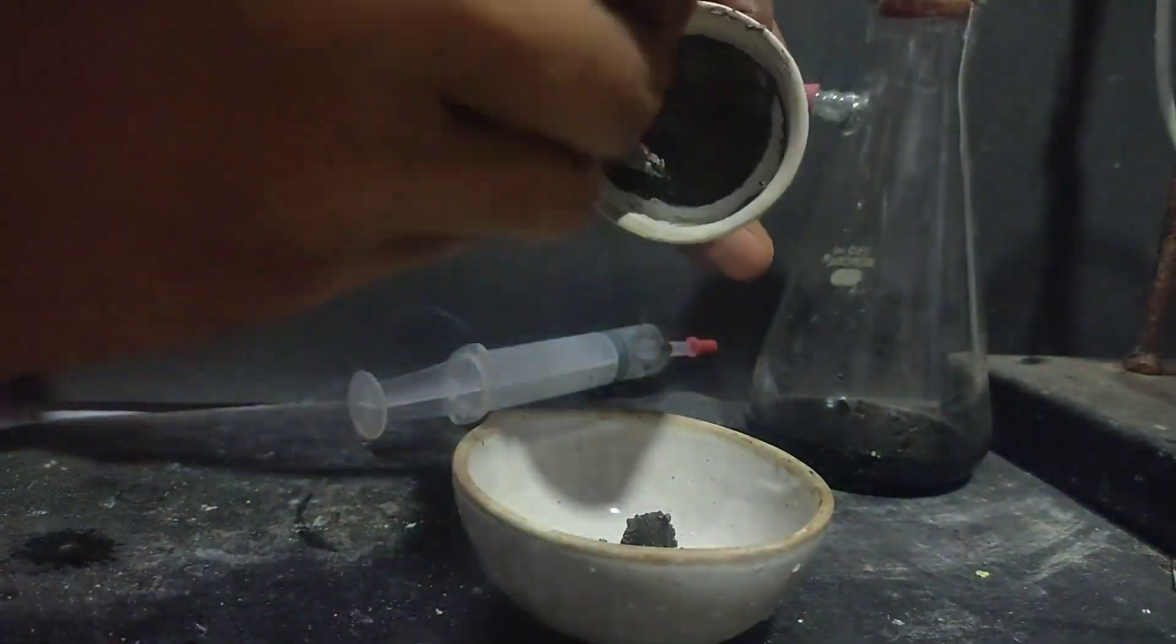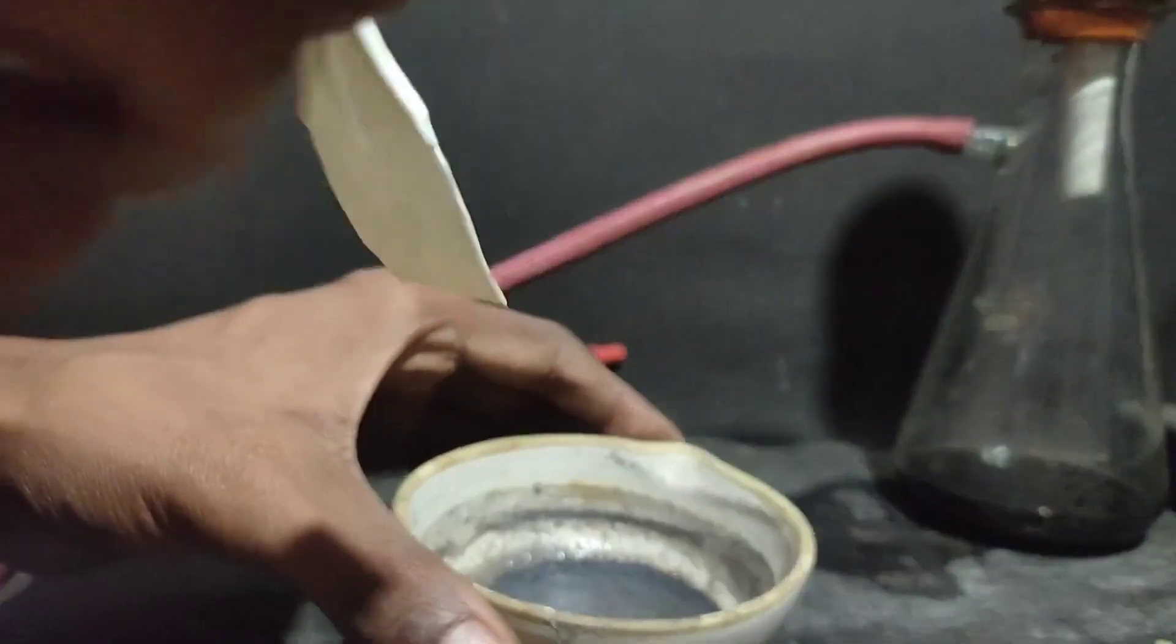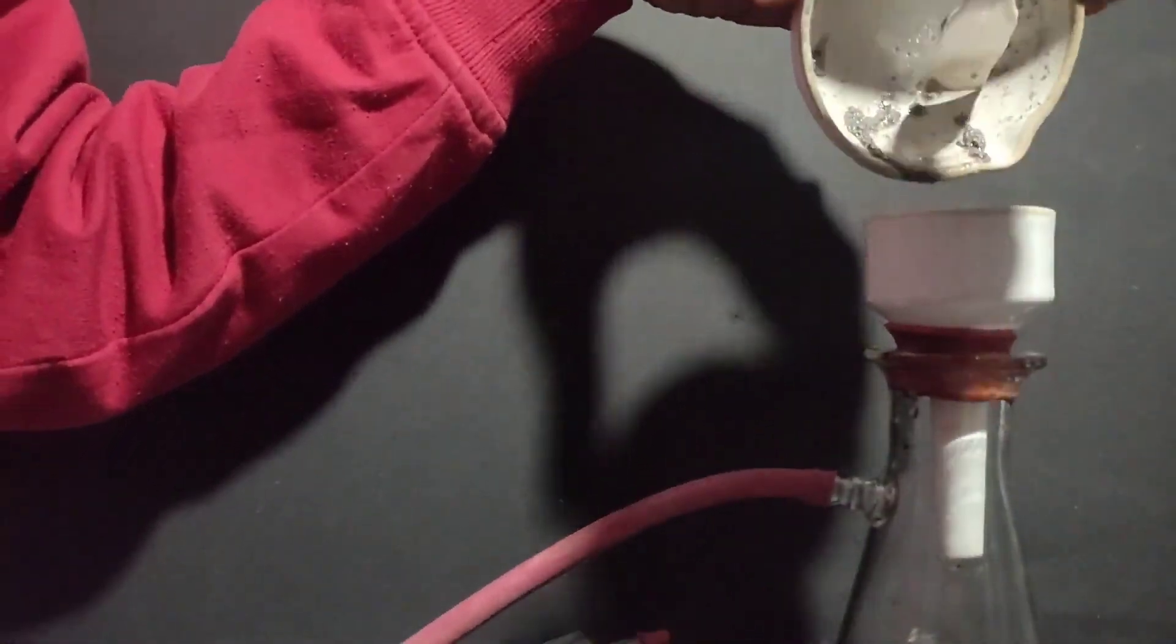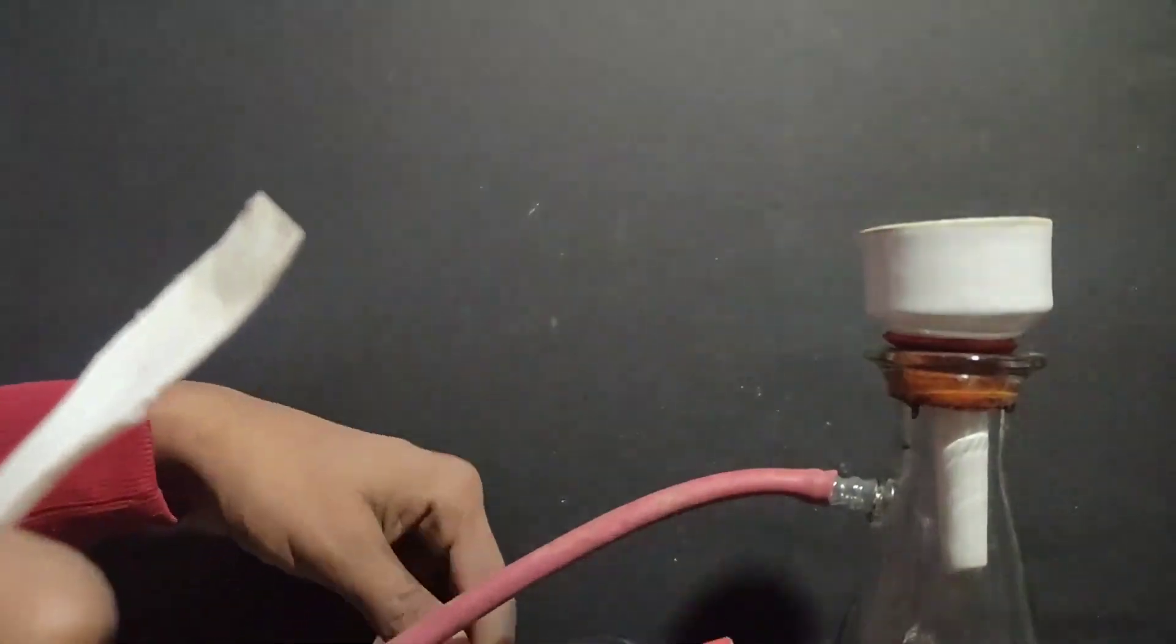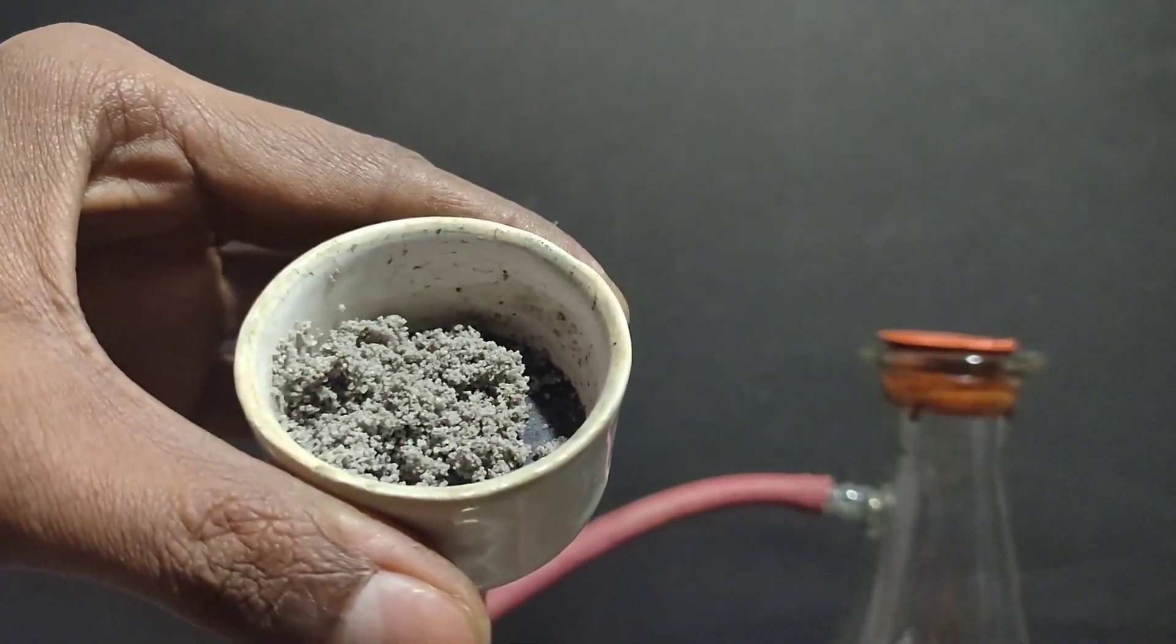Then I took the crystals in an evaporating dish and again recrystallized it from distilled water. This time the crystals were much better. I filtered them again with vacuum filtration and washed with cold distilled water. The crystals were still grey, but less than before.